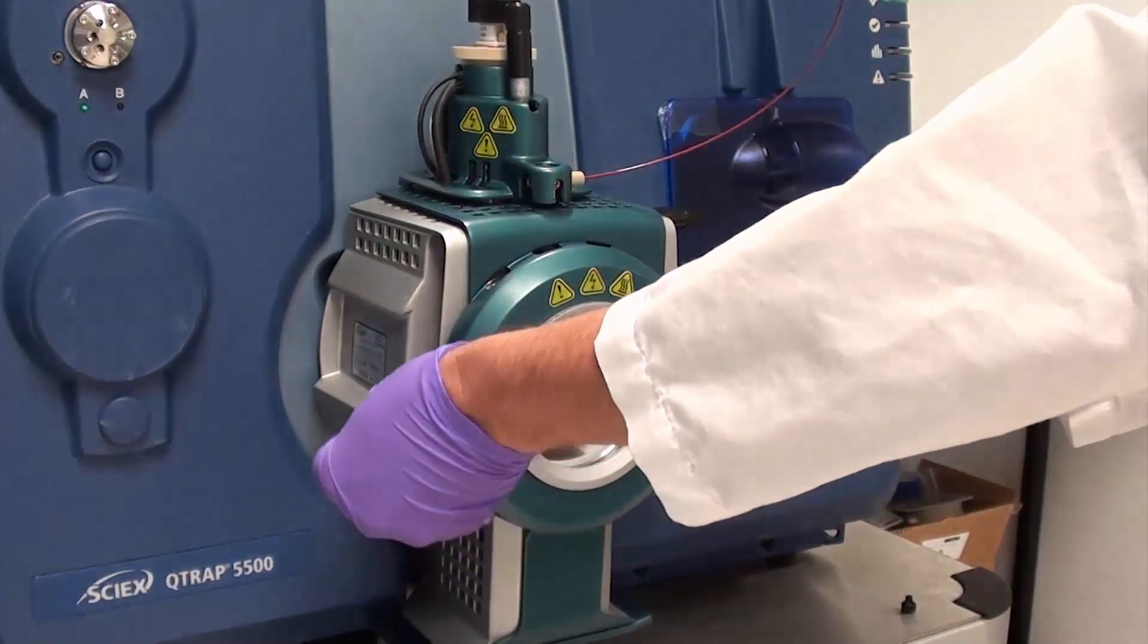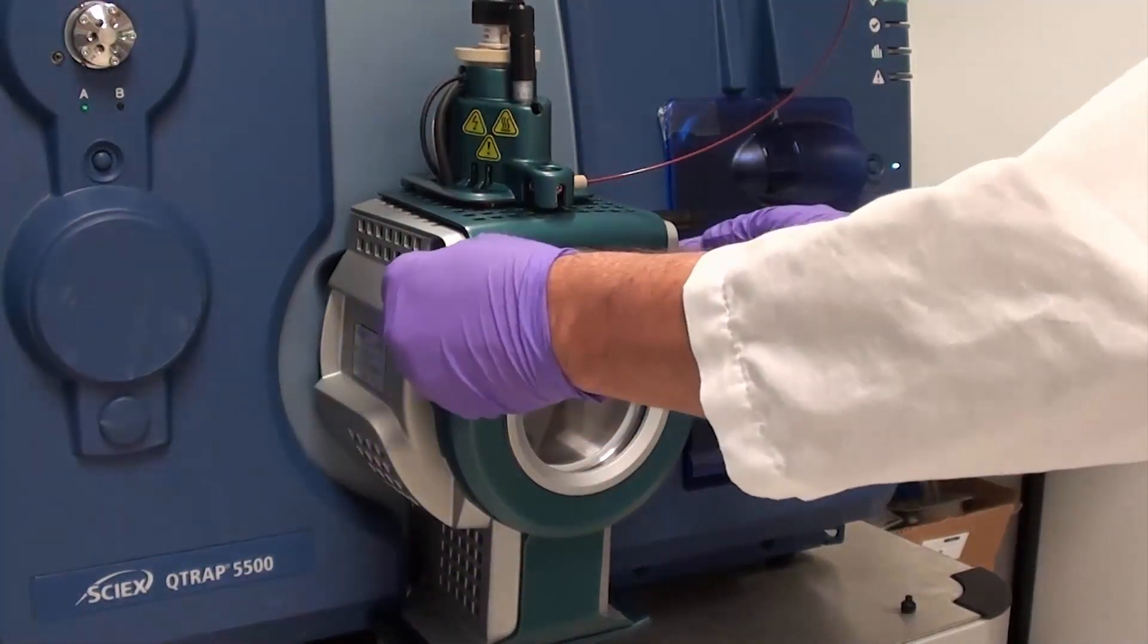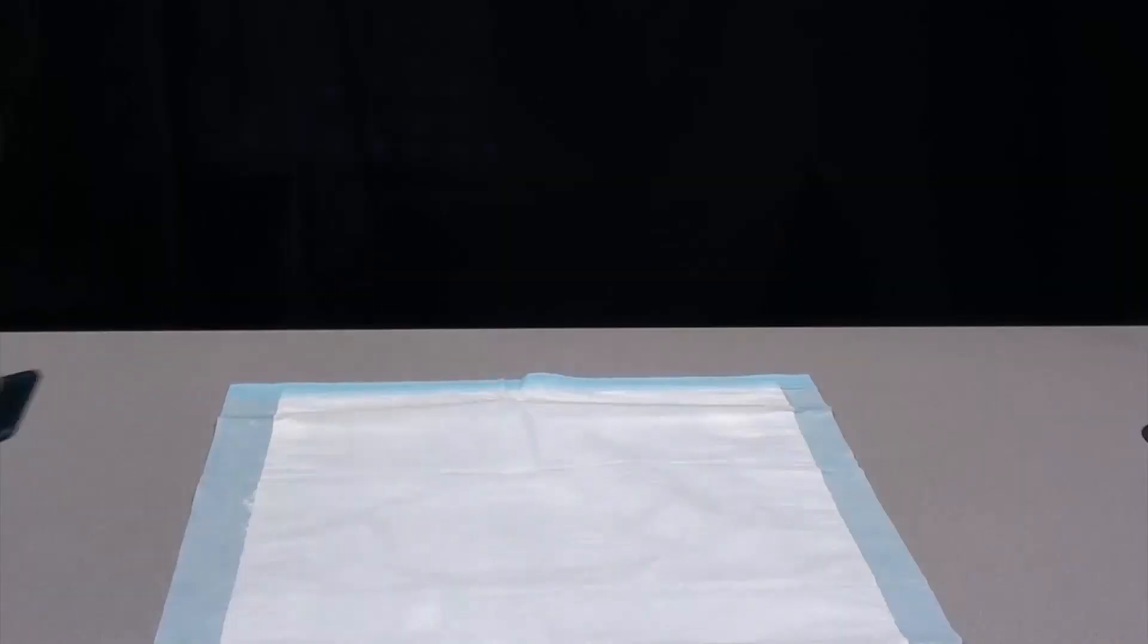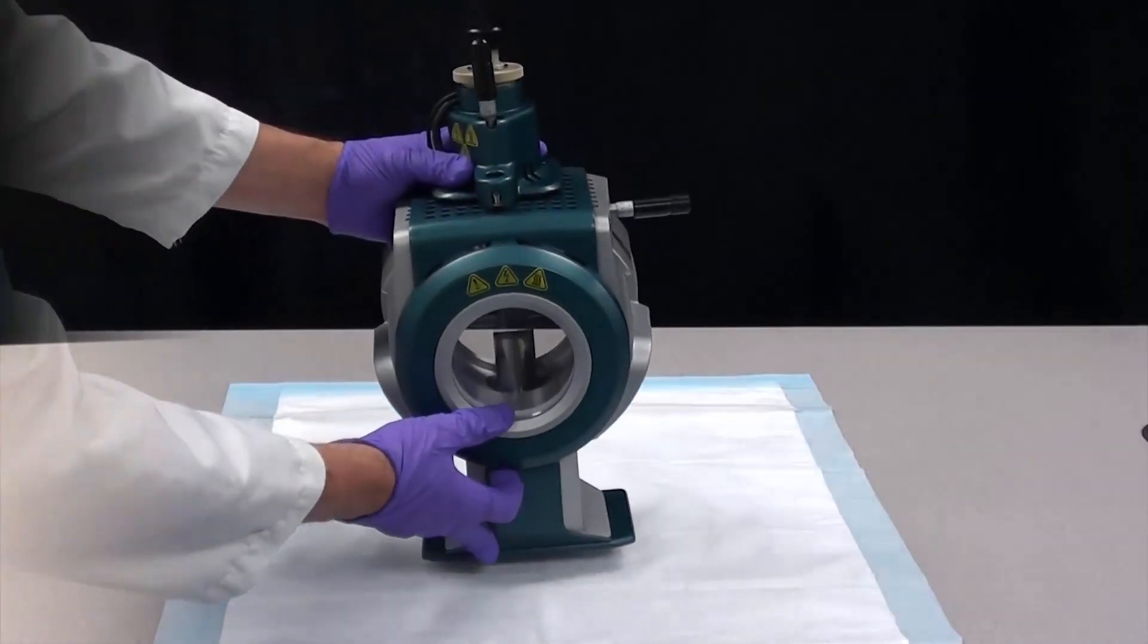Turn the two source latches upward to the 12 o'clock position to release the ion source. Pull the ion source gently away from the vacuum interface. Put the ion source on a clean, secure surface.